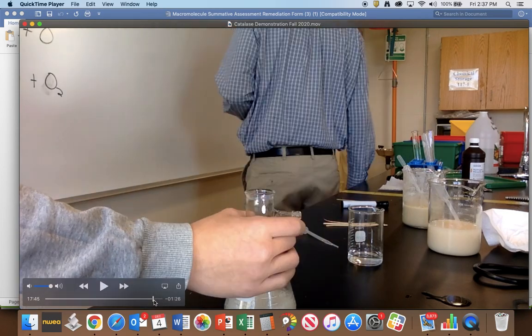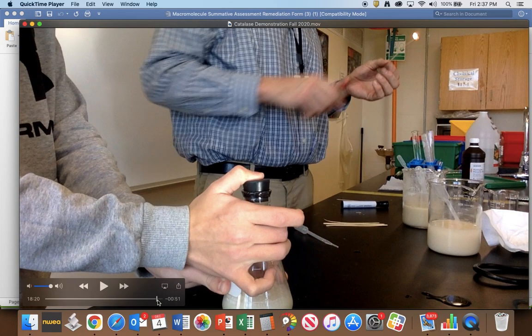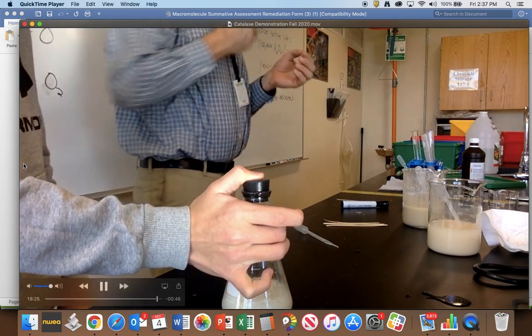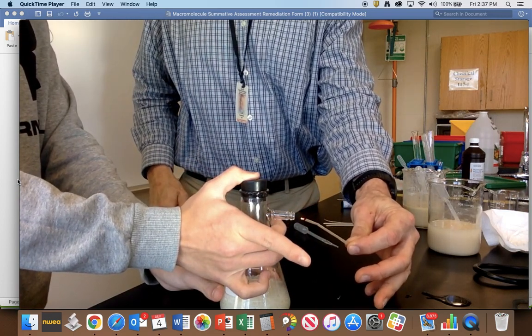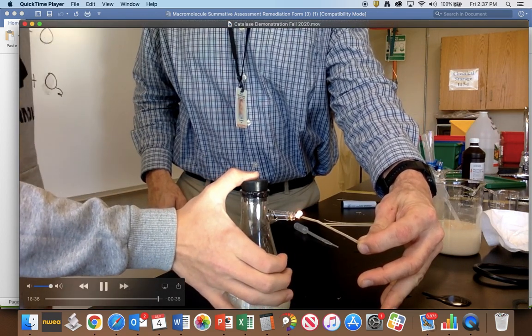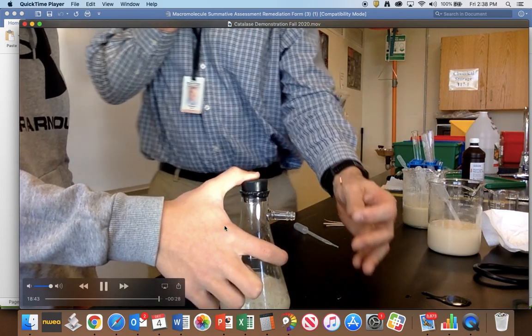So I'll make the reaction happen again. I'll add more stuff to it. Now there's the thing being lit. I've got to blow it out, but it's Corona time, so it's hard to. There, now that's just an ember, and if they take the finger off, notice that the stick is relighting. So that's oxygen gas coming out. If it was hydrogen gas, it would explode. Okay, so that's the end of that video.